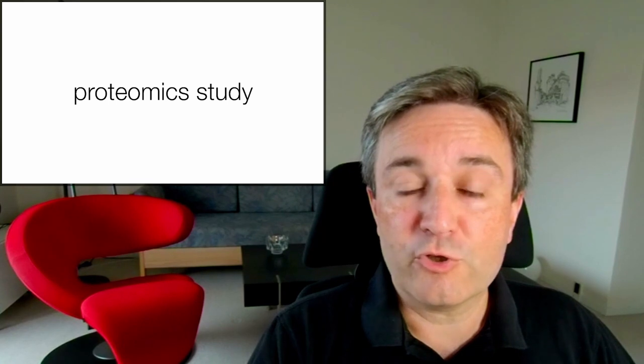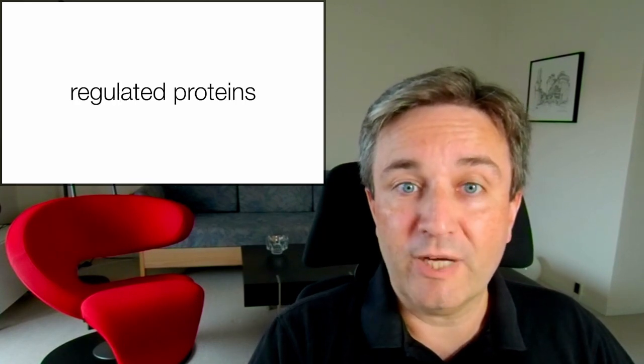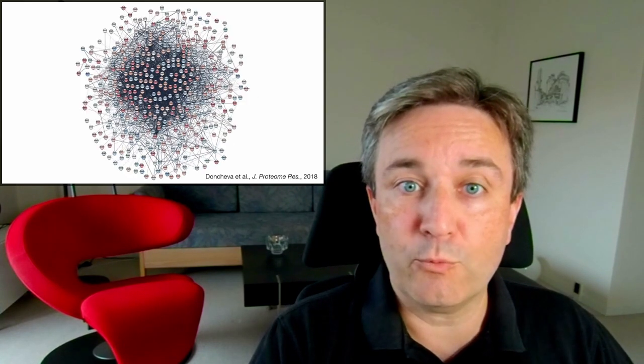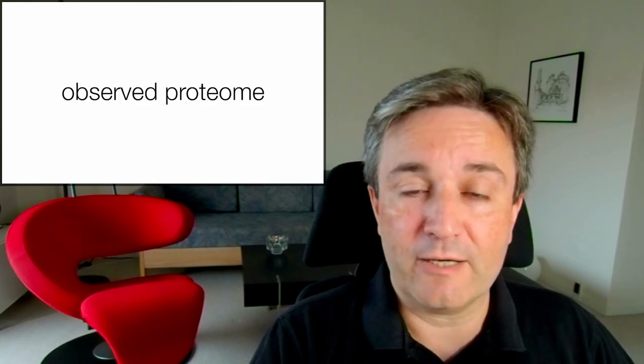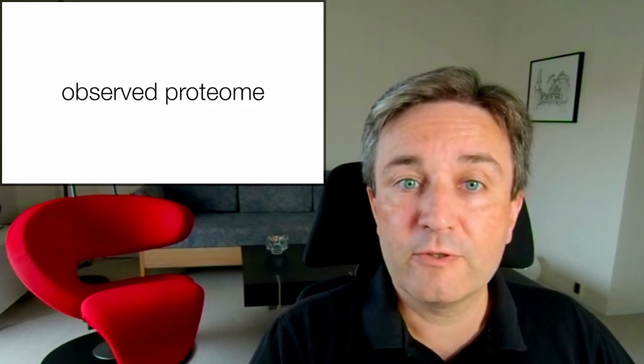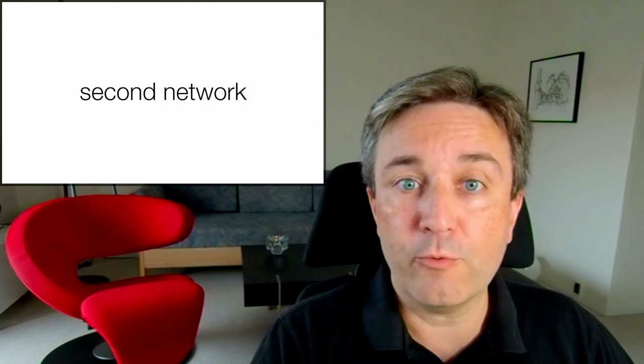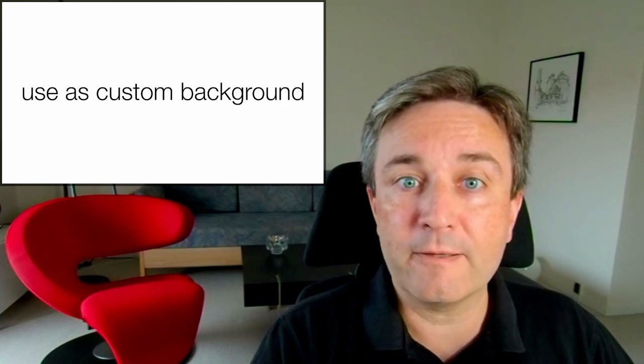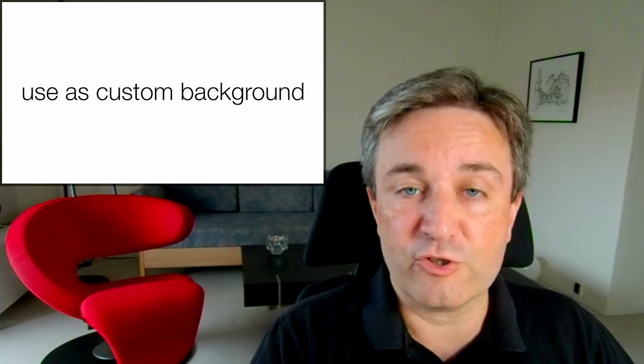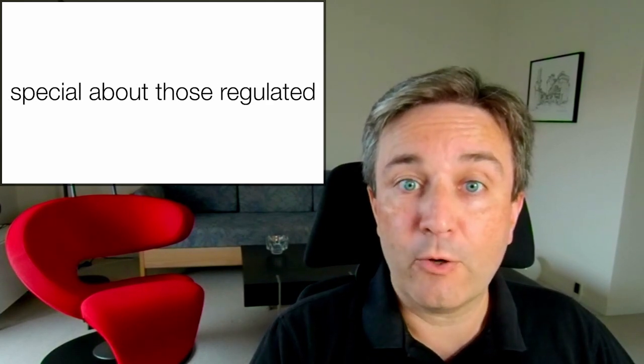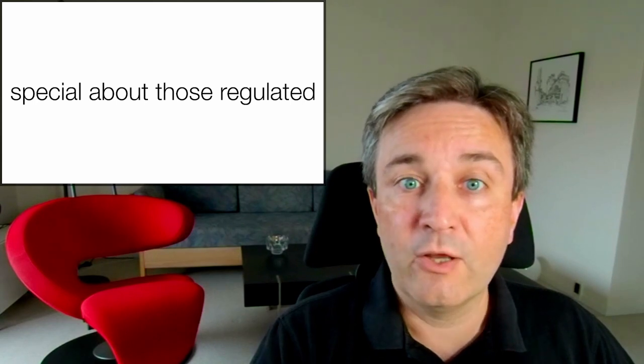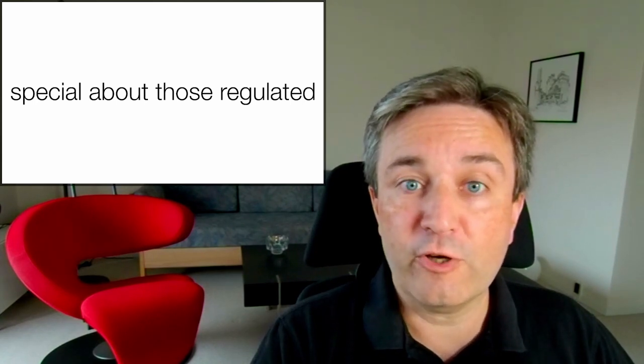If, for example, you've done a proteomic study and you've taken all the regulated proteins and produced a network like this, you will want to use the observed proteome as background. To do this, you load in the observed proteome as a second network in Cytoscape and use that as your custom background. That way you find out what's special about those proteins that are regulated compared to everything that was observed in your sample.